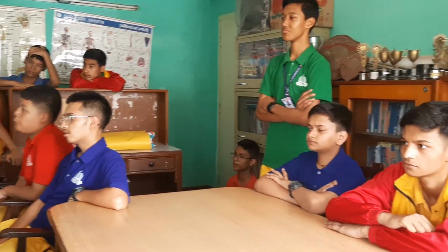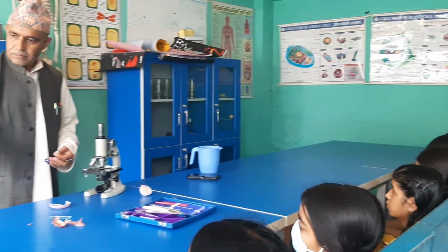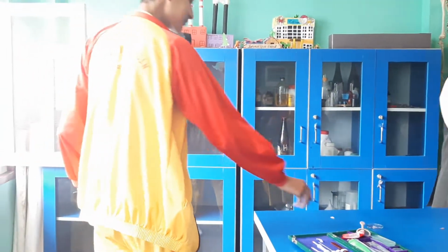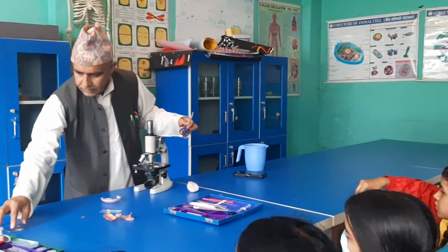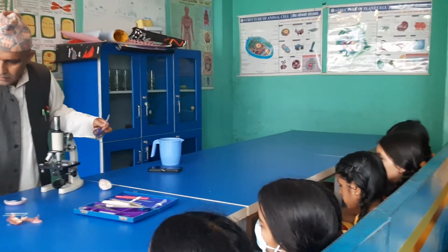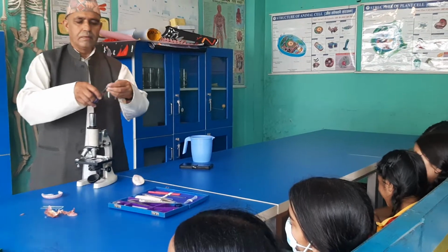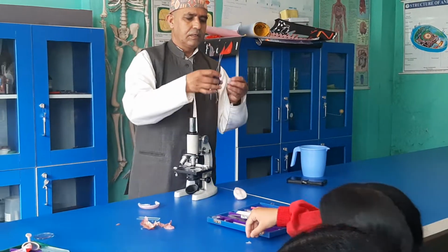Actually, why have we chosen this? It's better to cut it into small pieces and take out the peel, right? So small piece. Will you take it out, students? Some of you come here and just take out. You take out the small membrane and keep it here. And these membranes are not so much. Yeah, see, the membrane has come.